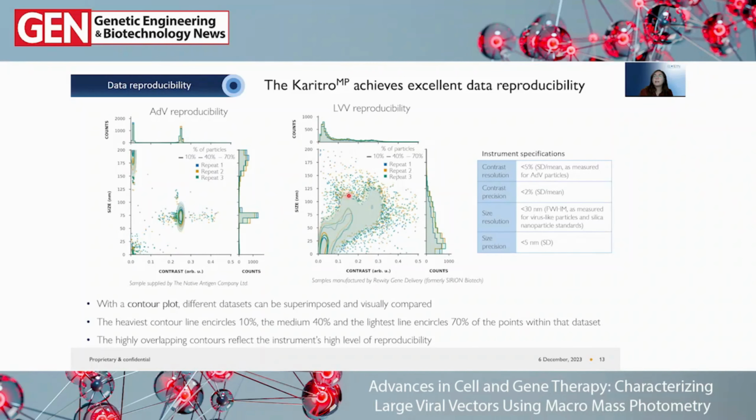You have also some scatter points outside of this region, which are the points that are more scarcely represented in the plot. So the way to look for differences and similarities is by assessing how much the contour lines overlap with each other. So in this case, if we look at the lenti graph, you can see that 10% of the data is always enclosed by this thickest line within the same regions.